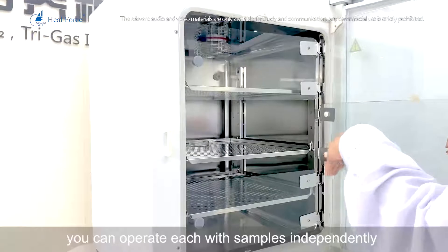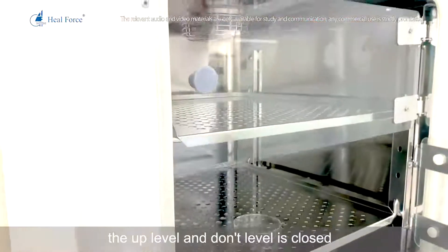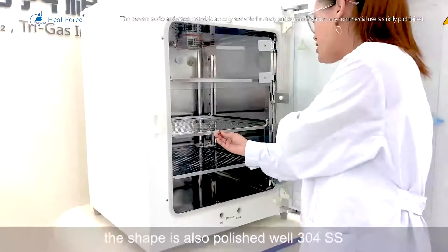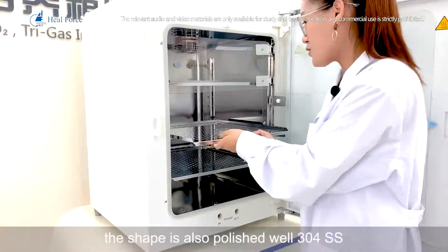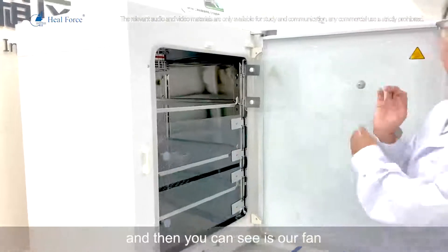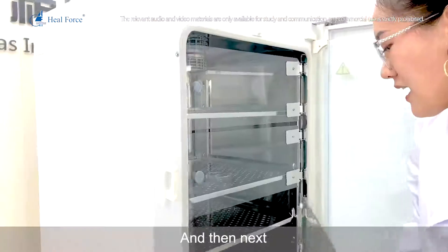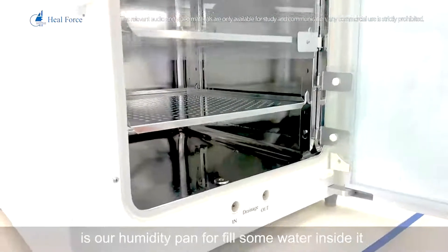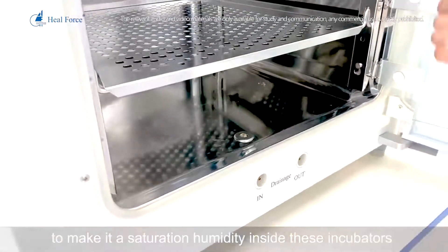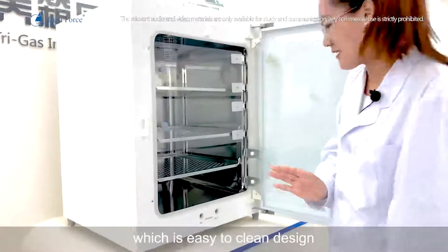When you open the middle level door, the upper and lower levels remain closed so each section is unaffected. The interior is also polished 304 stainless steel with a sliding design for easy operation. The fan is a German EBM brand, known for very good quality. The humidity pan is filled with water which evaporates to create saturation humidity inside the incubator. The humidity pan has a round-corner, easy-to-clean design.